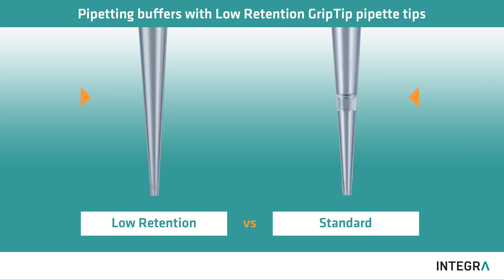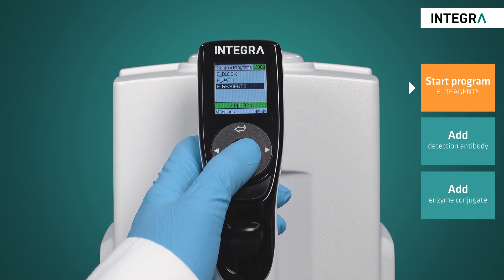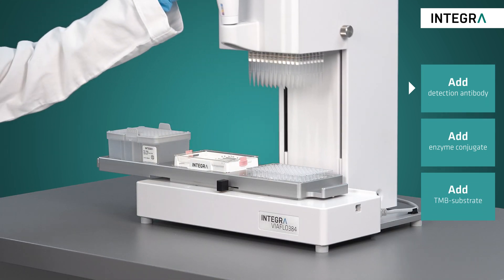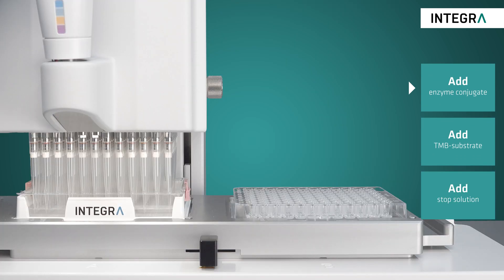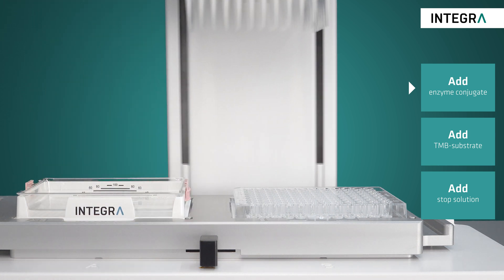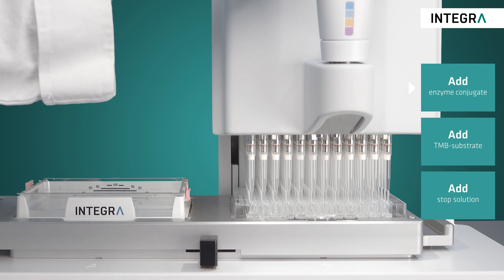ELISA buffers often contain surfactants like Tween 20. Using low retention tips reduces the residual volume in the tips for maximum sample recovery. After incubation and washing, the detection antibody is then added to the plate and the process is repeated with the enzyme conjugate. Simply start the corresponding program on the pipette and use the ViaFlow 96 to quickly and easily treat the plate, regardless of all the multiple and repetitive pipetting steps.